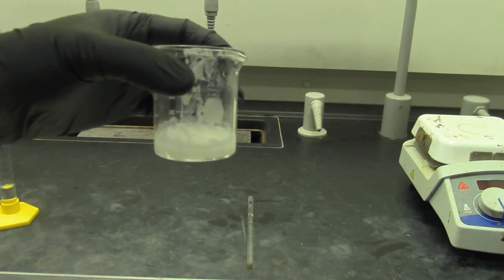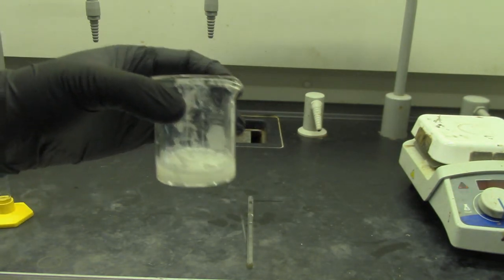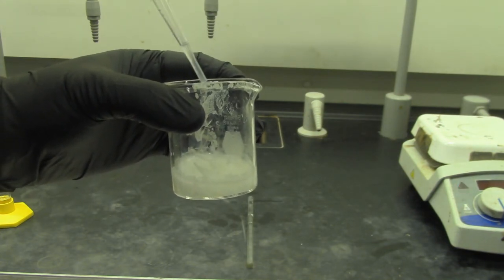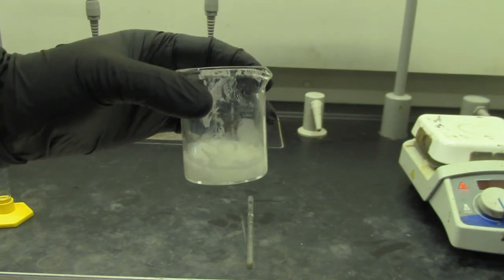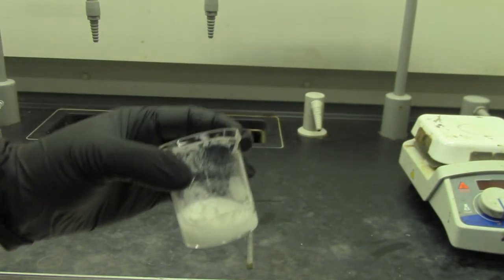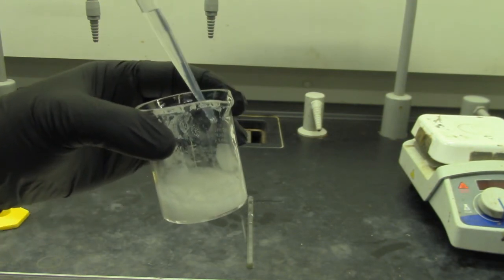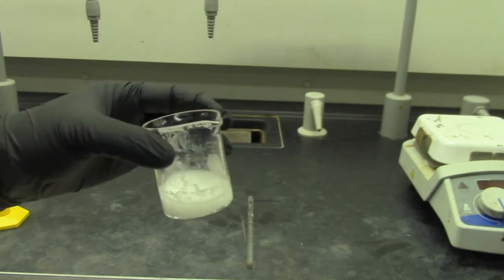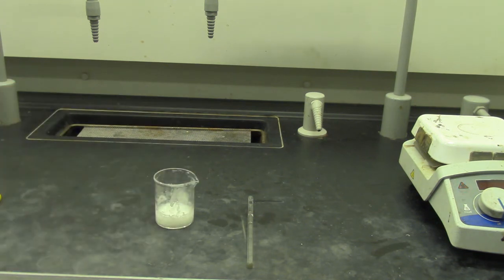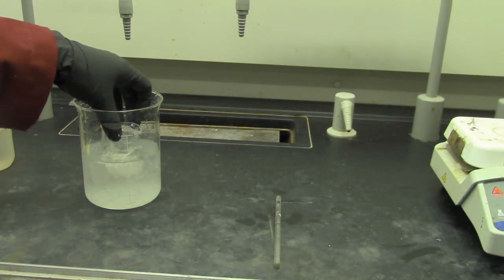Oh, not very good with the camera. Oh, sorry. Okay, do it again. It's at the corner. And do it again. So I added 5 more. Okay, so you're seeing a lot of white precipitate. So what is that white precipitate from? So is this 5 ml good enough? Okay. I'm going to have to put this in an ice bath. I have an ice bath, and I'm going to let this beaker sit in there. Okay, chilling.